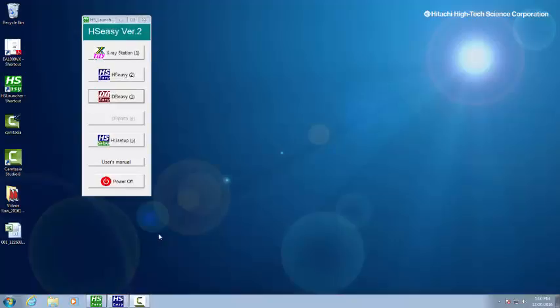Now I'm going to show you the reporting features of the Hitachi EA 1000 VX. We just did some measurements, ROHS measurements.